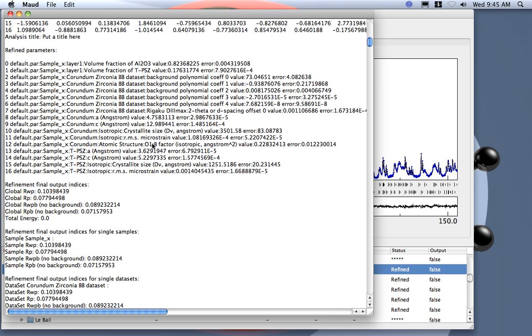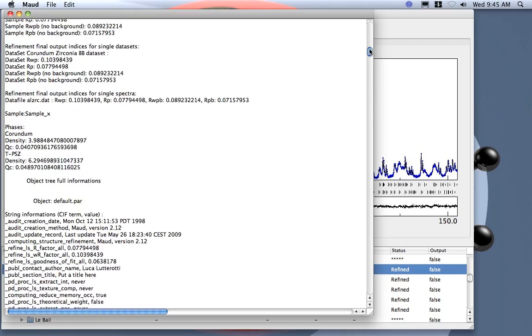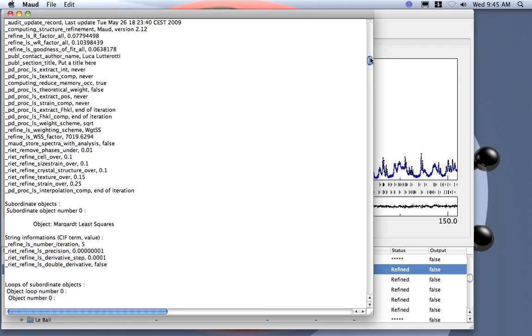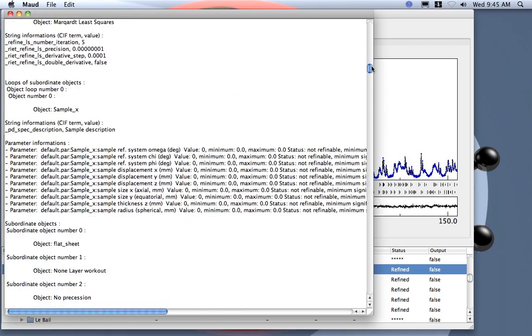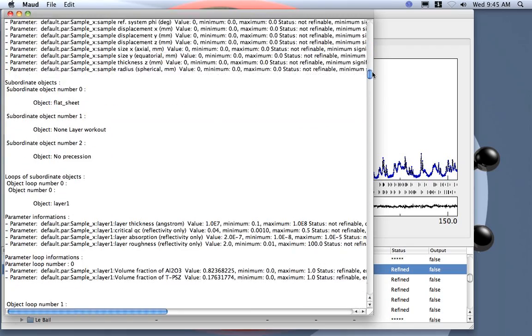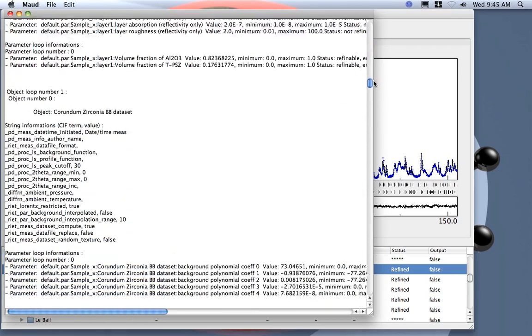So the O1 for the corundum. For the tetragonal zirconia also, the crystallite size, microstrain, and cell parameters were refined. You can check that.